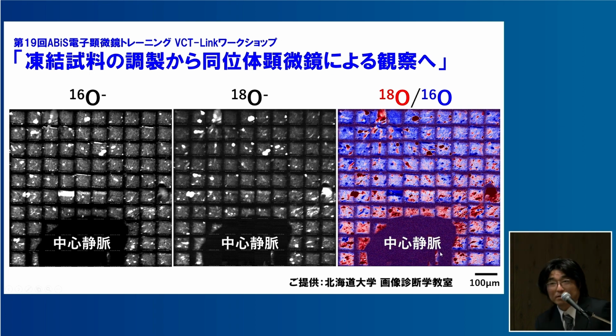This is a vein. We can also see some gradation from the vessel to the vein. This took, I don't know, 6 or 8 hours after 5.